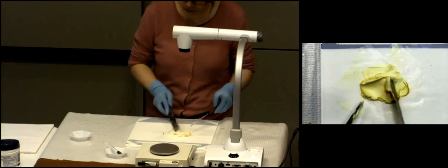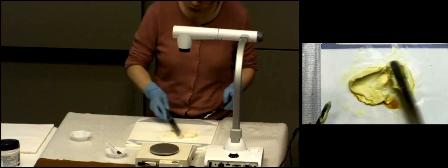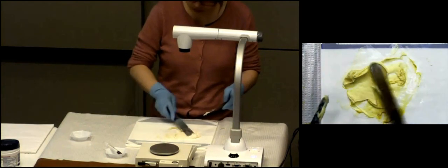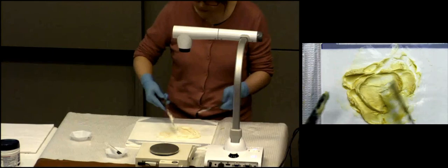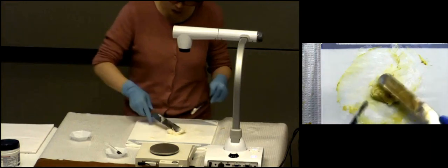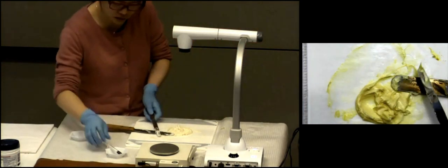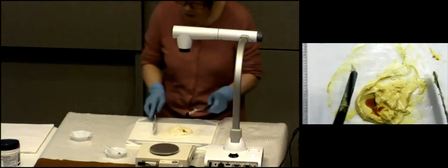All right. So I'm going to watch the magic here. It looks so oily, but then it can absorb the moisture, or water, for you. All right. As much as I try, my area on the parchment paper has increased already. All right, and then you just need to do your best. Try to not use a whole piece of paper. Okay, so let's add the rest all together. And let's spatulate again.